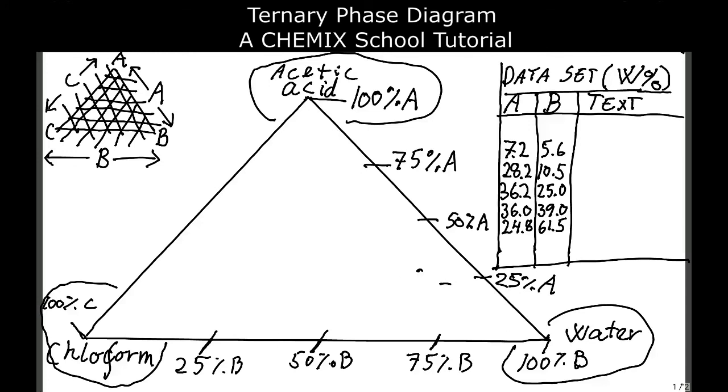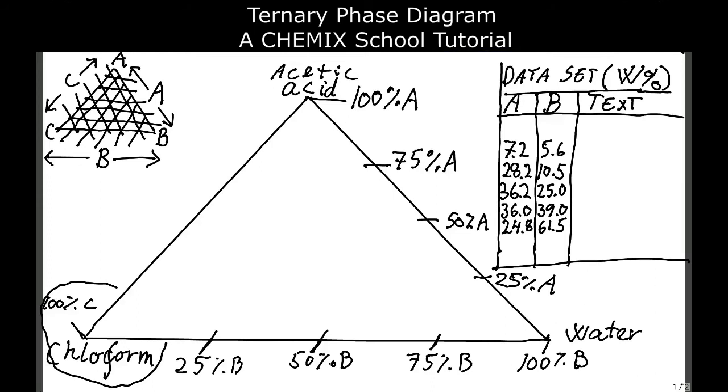As we can see in the table at the top right, we have found 5 boundary areas where the phases change from one phase to two phase or vice versa. We will now plot these data points in the phase diagram.